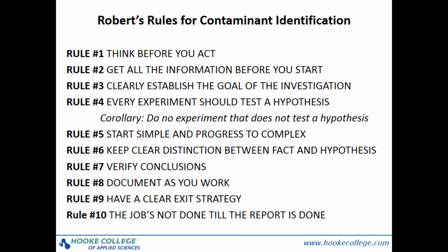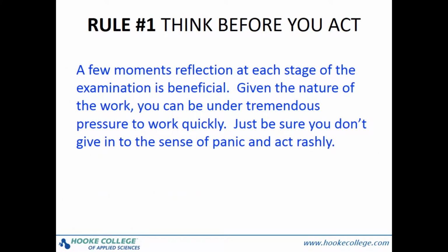This is really just a compilation of general principles that I have learned over time, sometimes painfully, for conducting contaminant analysis. Rule number 1, think before you act. It's always seemed odd to me that as scientists we get paid to think, yet nearly everything in industrial R&D is designed to make it more difficult to think. So very many distractions. Open offices are just the latest in that progression, in my opinion.